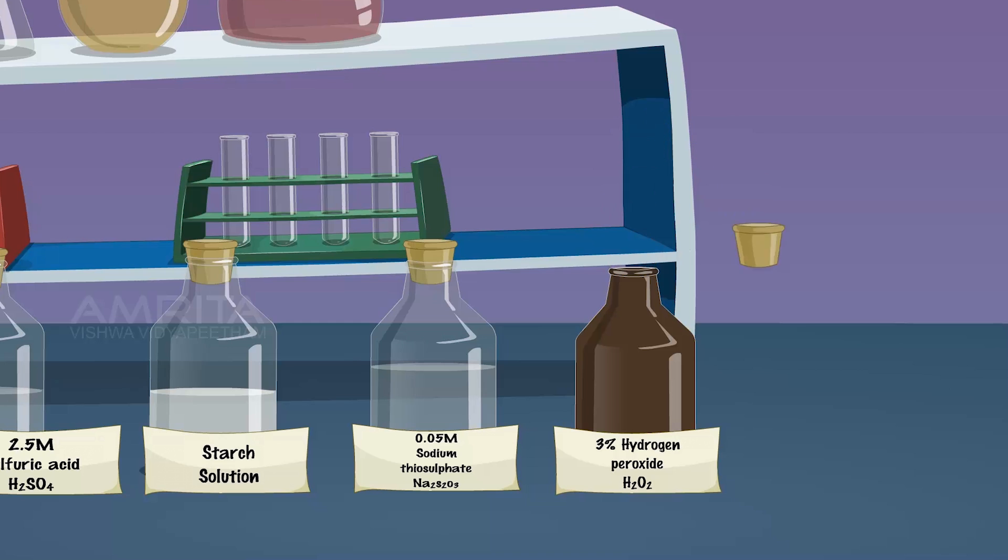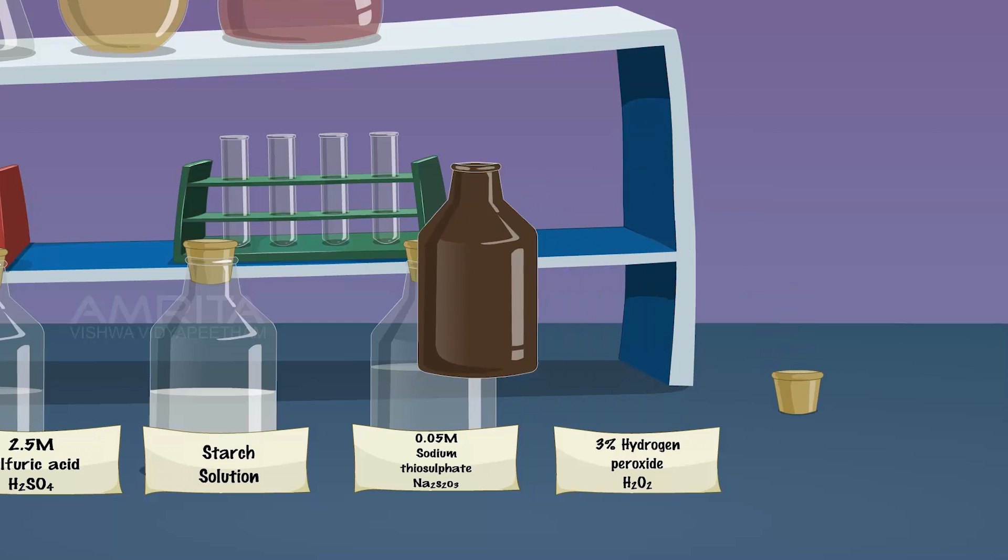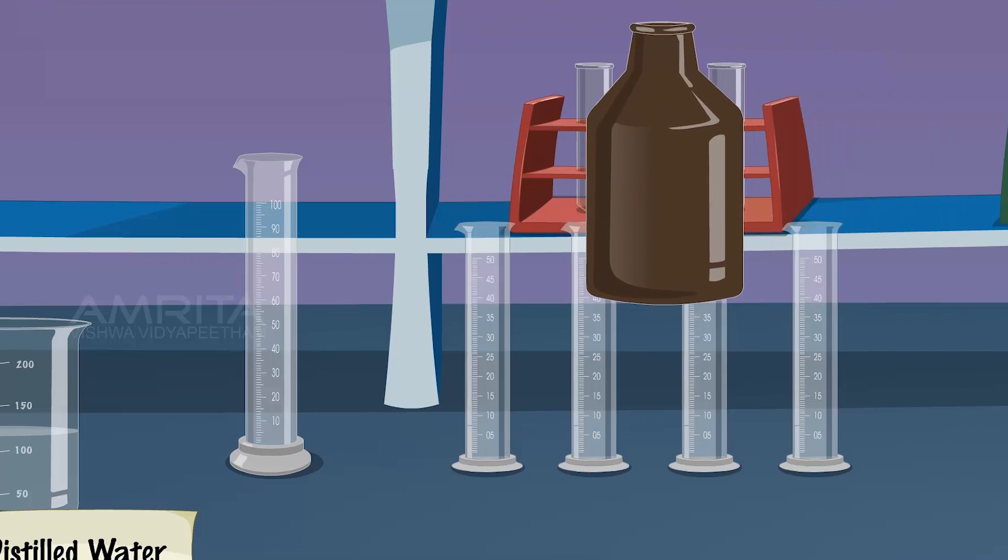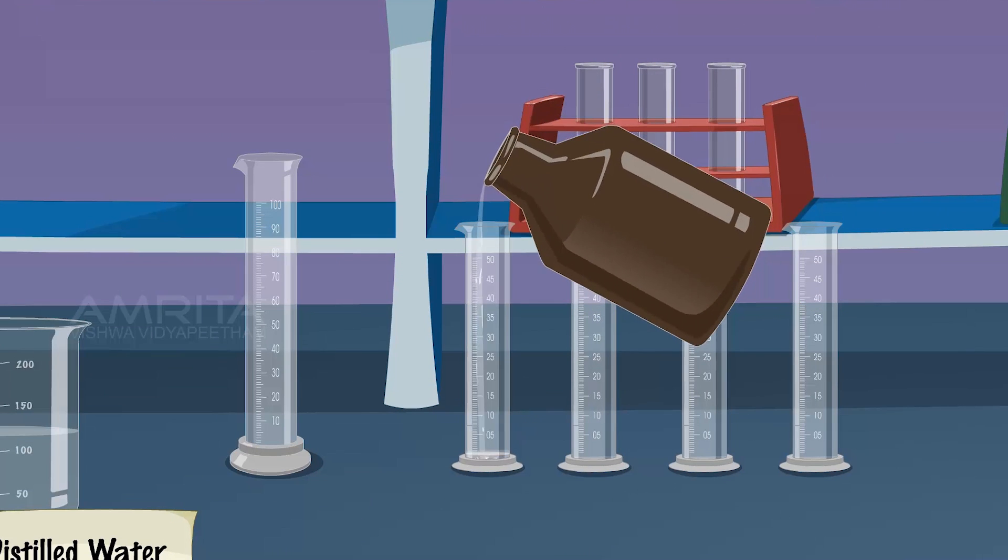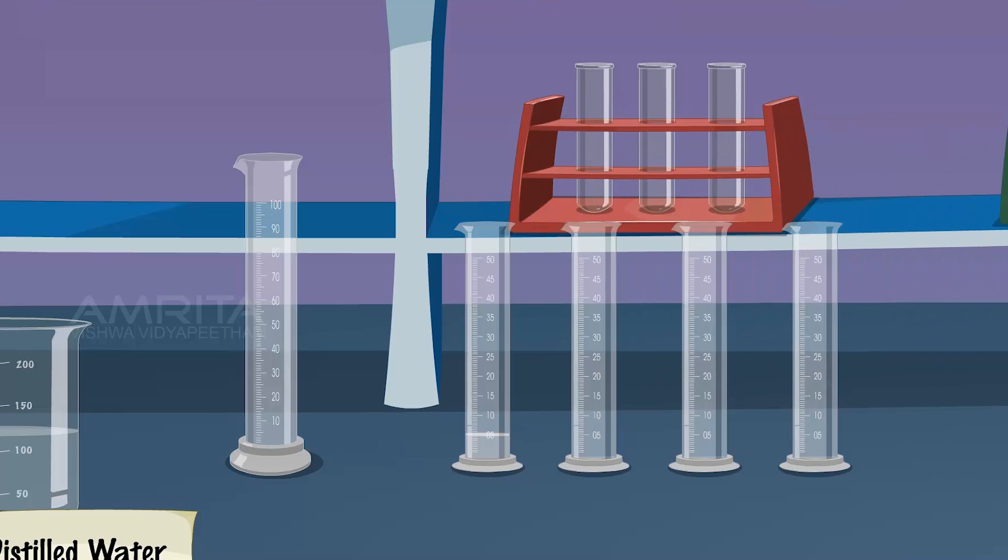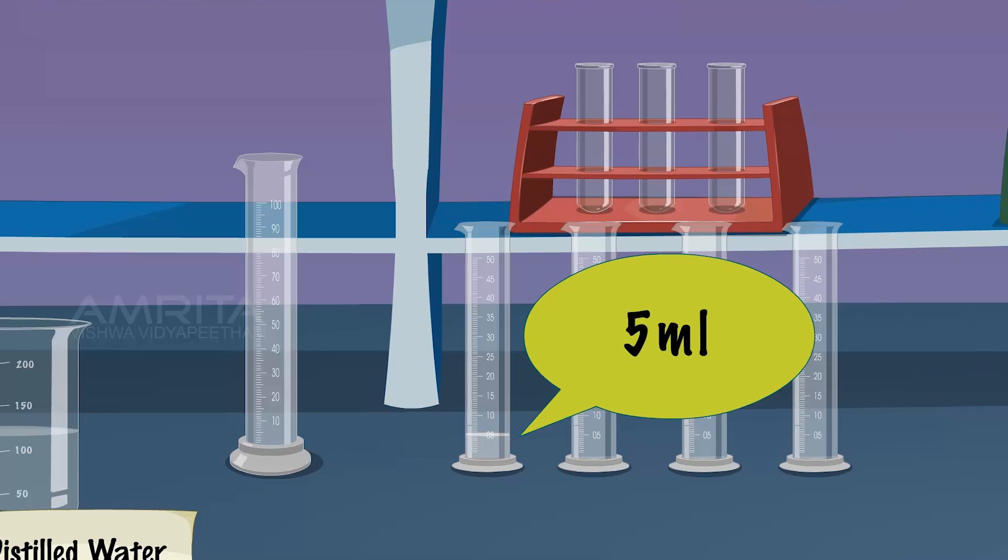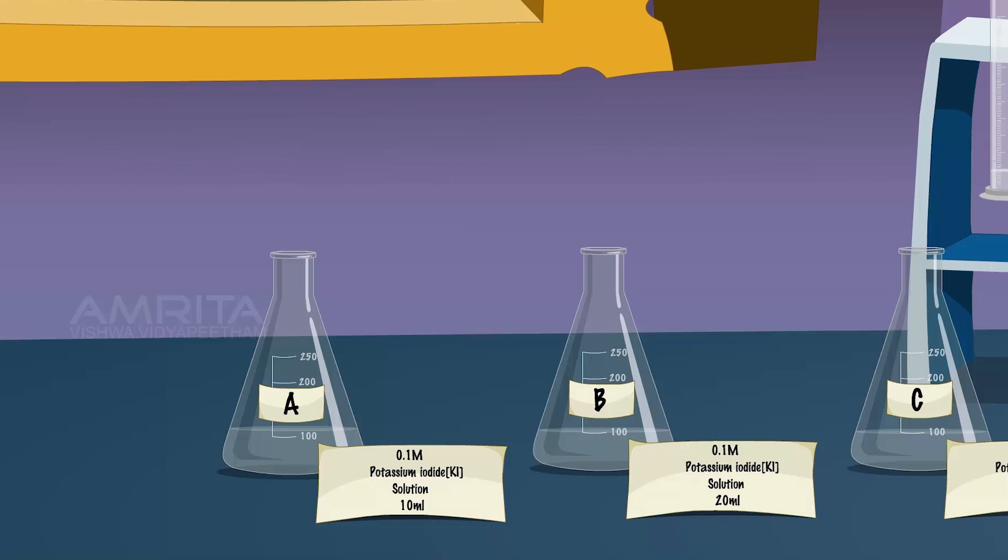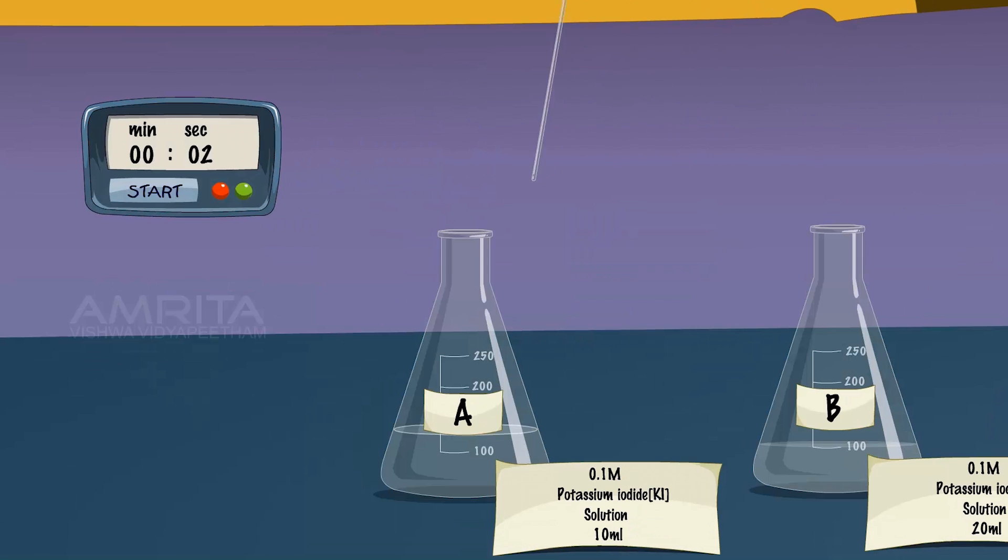Then take 5 ml of 3% hydrogen peroxide solution. Pour it into flask A and start the stopwatch immediately. Stir the mixture using a glass rod and watch for the blue colour to appear. Note the time when the blue colour just appears.